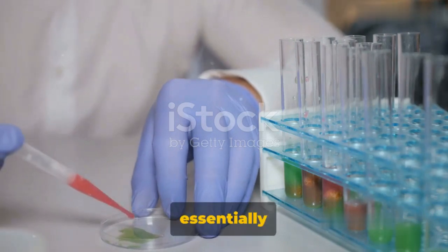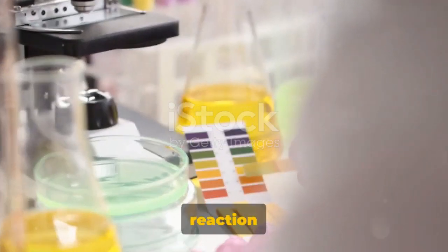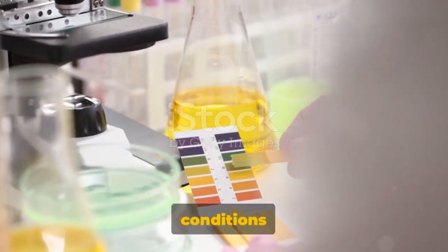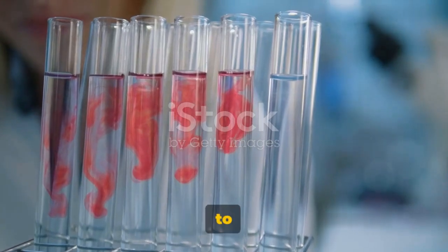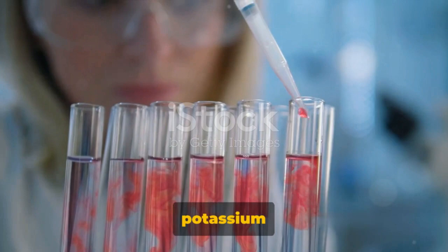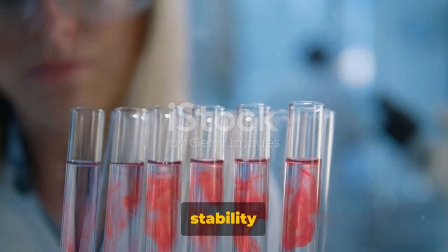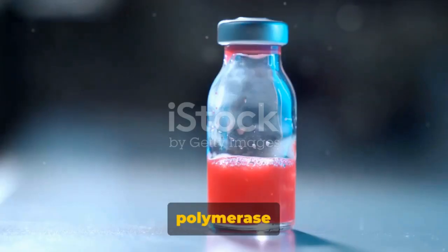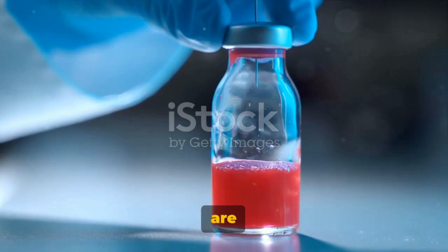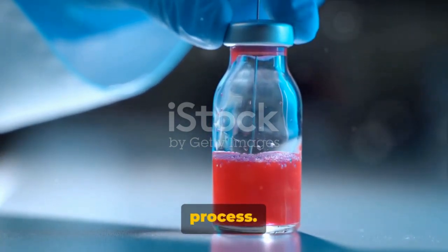Now, let's talk about PCR buffers and other chemicals. PCR buffers are essentially solutions that provide an optimal environment for the PCR reaction to occur. They help maintain the correct pH and salt conditions that are necessary for the enzymes to function effectively. These buffers often contain potassium and magnesium salts, which are crucial for the activity and stability of the DNA polymerase enzyme. In addition to the PCR buffers, there are other chemicals that are also important in the RT-PCR process.